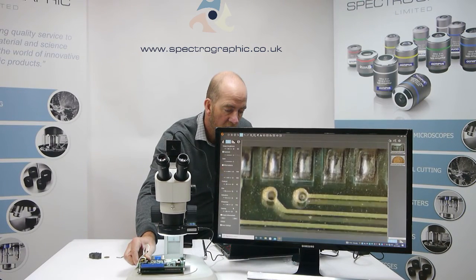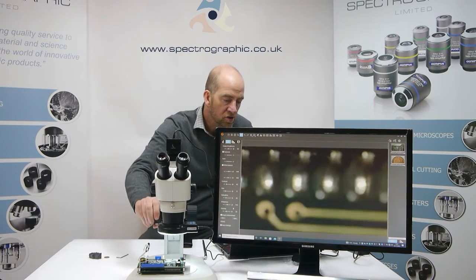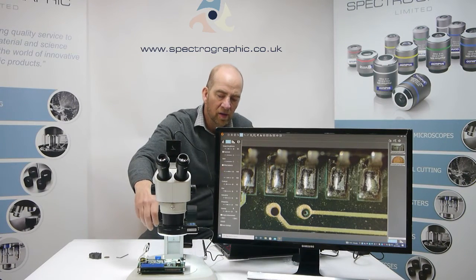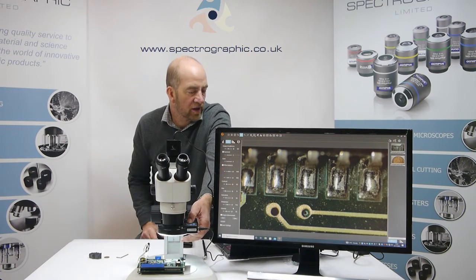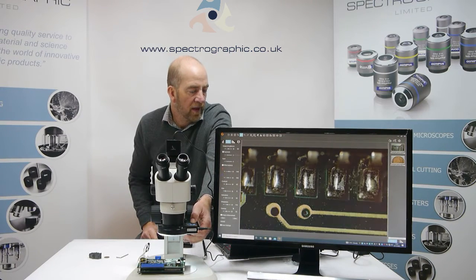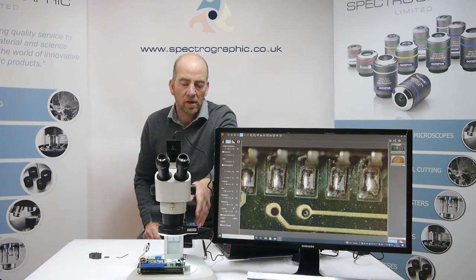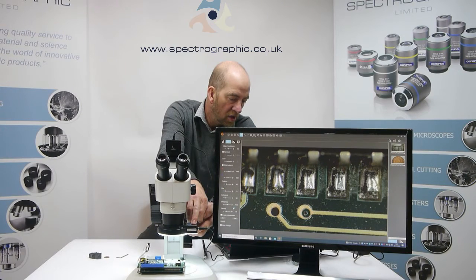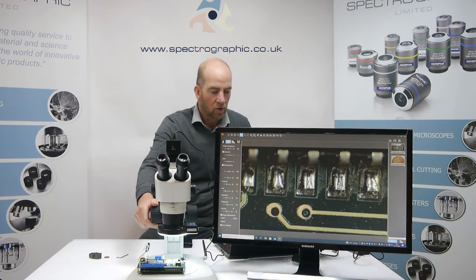Let's try and find an interesting area, maybe here. So we've got depth of field here, and it would be interesting to look at this with extended depth of field. This is the ring light here, which we're using. I can adjust the mode to adjust the angle of illumination.